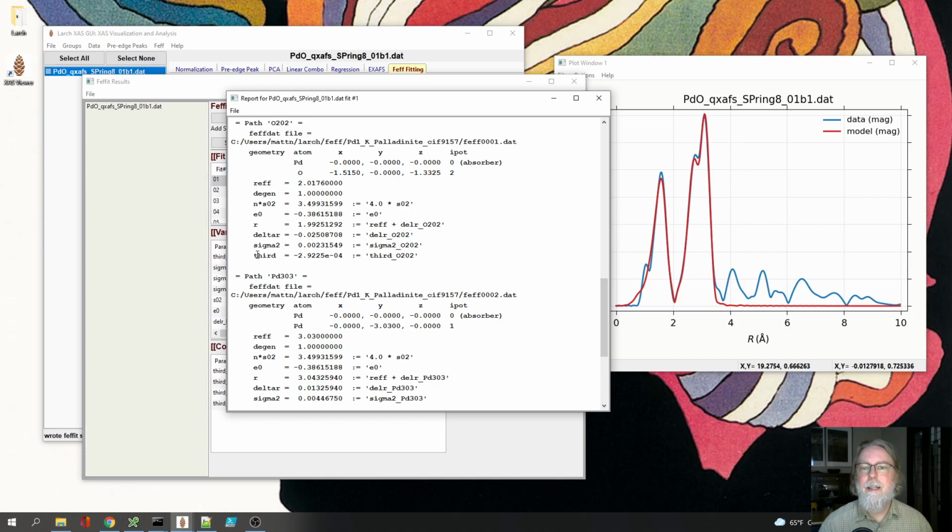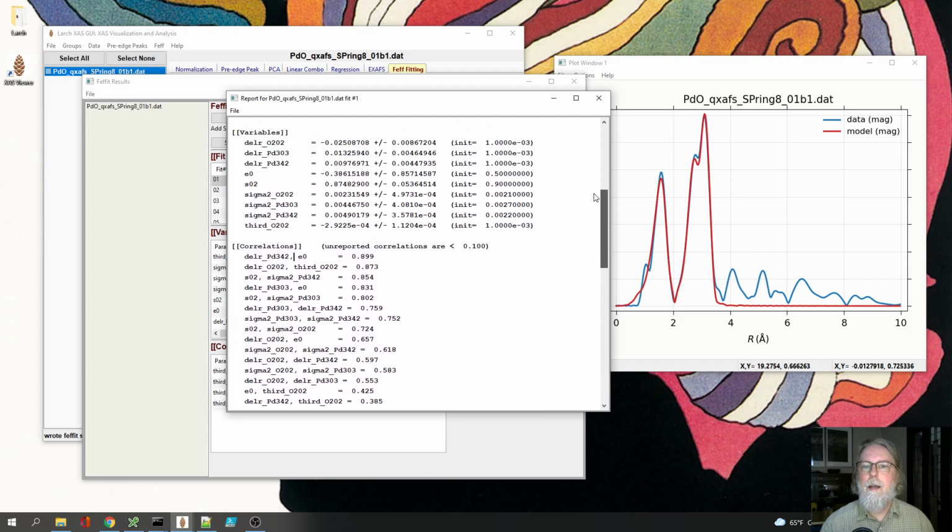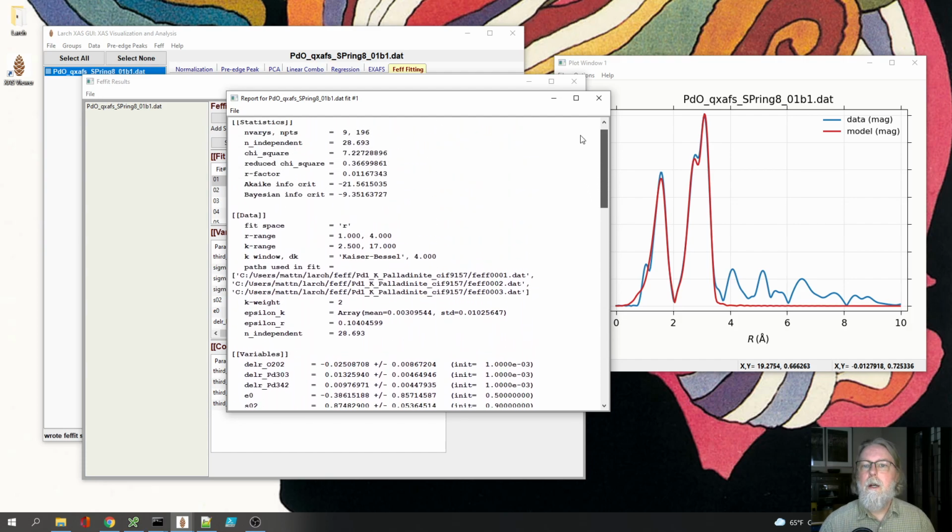You'll often see the opposite case, that you try to add a third cumulant and you get a value that's small, but its error bar is enormous compared to its value itself, so that it's consistent with 0, and the reduced chi-square and other information criteria don't improve by adding that variable.